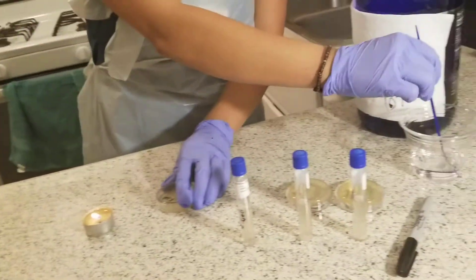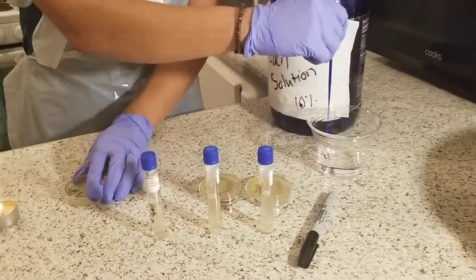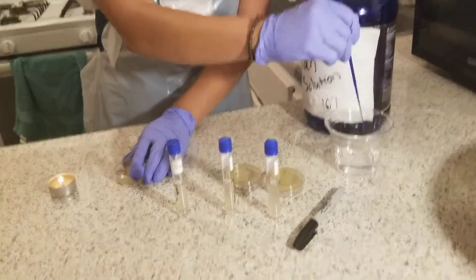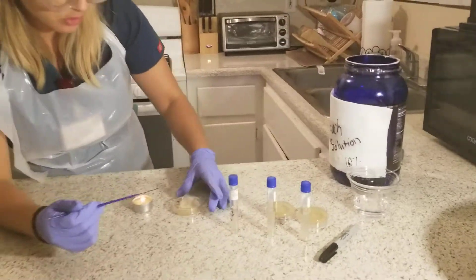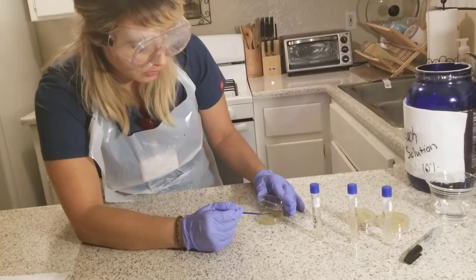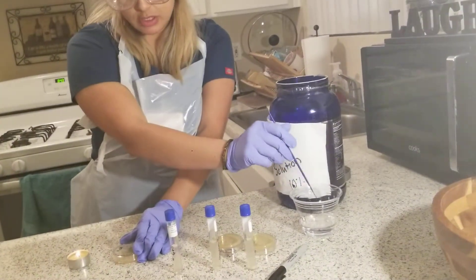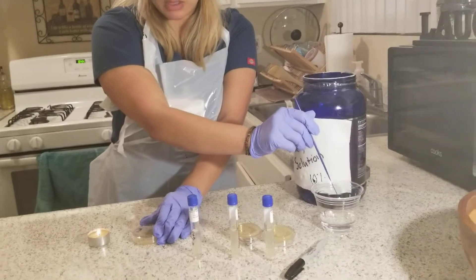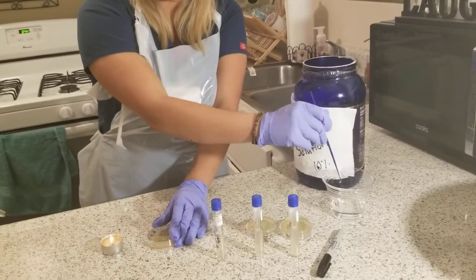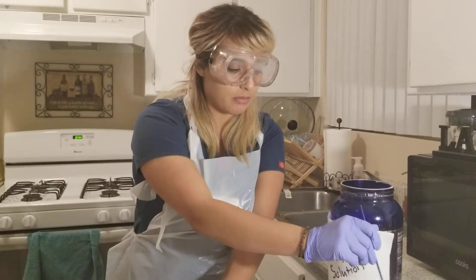Then once again, put it in the alcohol and let it dry for 20 seconds. And then I will go into the third — I'm also keeping the lid over it so it doesn't have any contamination. I'm going from the first quadrant to the second, and then grabbing from the second quadrant to the third, and then from the third quadrant I'll be going into the fourth. And then this should be creating the isolation of colonies for the microbes.